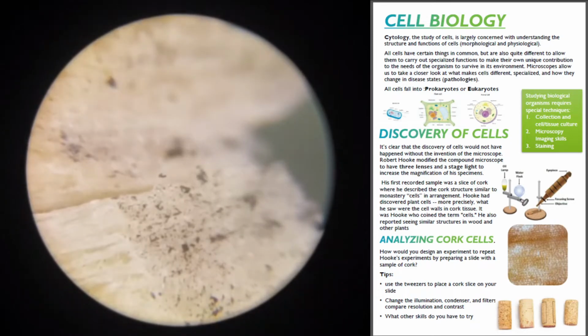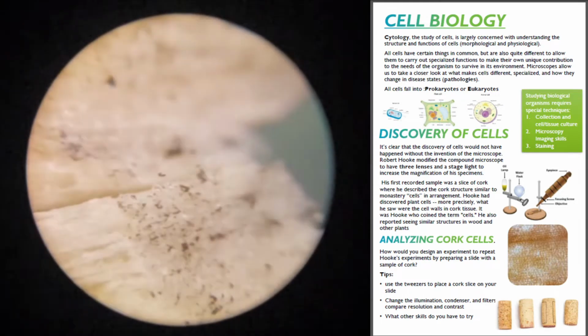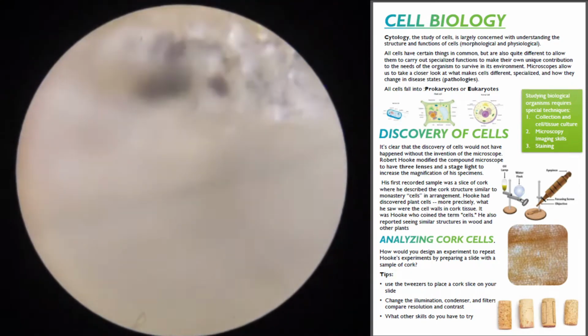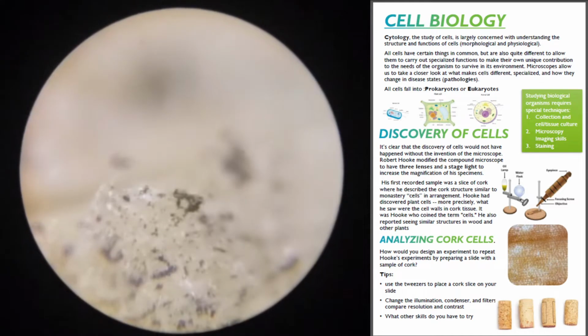Pretty sweet. I'm going to turn my revolving nose piece. I'm going from the scanning 40 total magnification up to 100. Fine knob only. Fine focus knob only. Thank you for not breaking your own stuff. Nice. Went a little fast. Very cool.